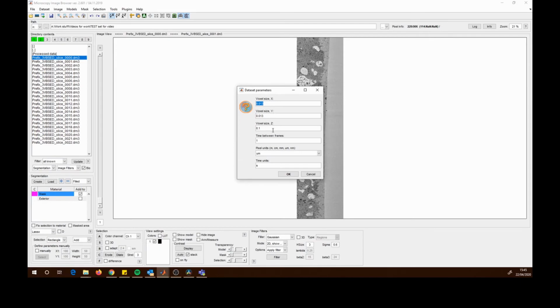Now, these are known as the voxel sizes. So a voxel is just a 3D pixel for anybody who's fairly new to image analysis. So that term will get thrown around quite a lot. So this means your voxel is 0.013 by 0.013 by 0.1 microns in size. So it's more of a cuboid in this data, but it would normally be a cube for other data types such as CT, MRI. Anything that takes a slice, even optical slices, can sometimes have a different sized Z.